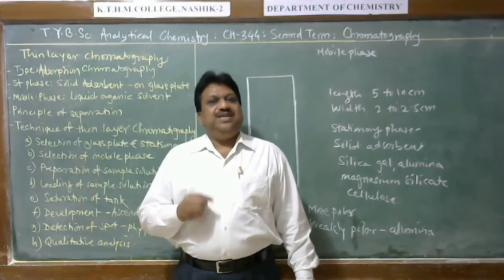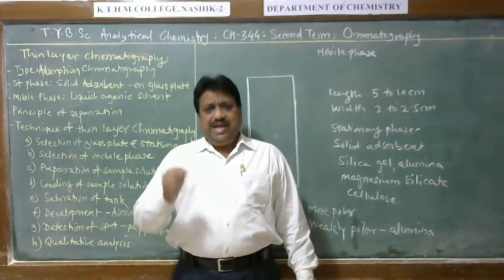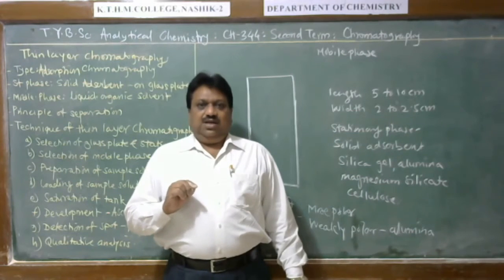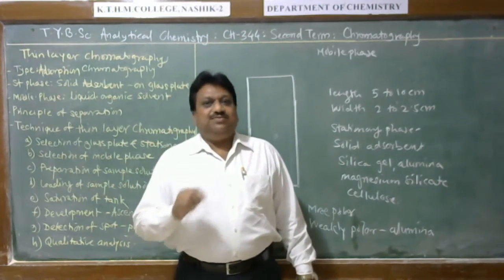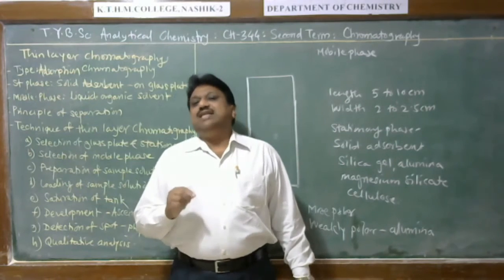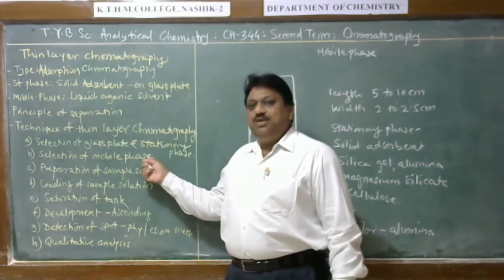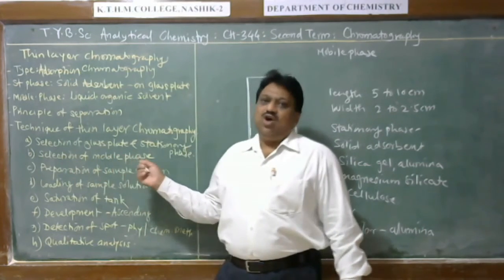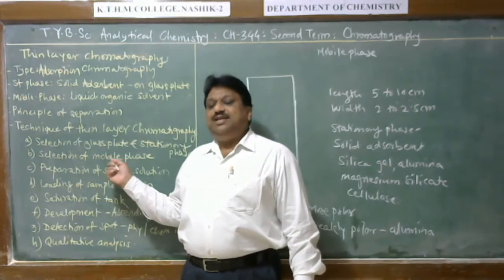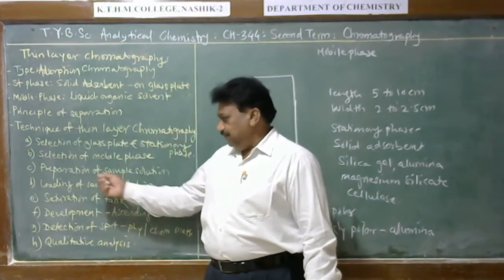The function of the mobile phase is to carry the sample components through the stationary phase in any chromatographic method. Therefore, depending upon the solubility, the mobile phase is selected in order to enhance the solubility of sample components. A mixture or buffer solution may be used.